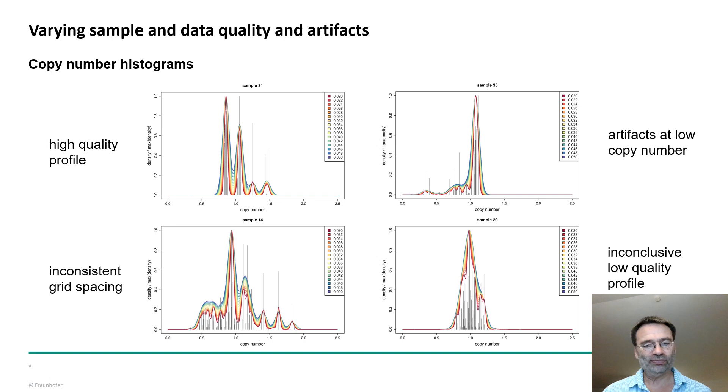So to show you the different quality of the data, the upper left image shows a very regular histogram of the copy numbers, and surely you could process those completely automatically with no problems. But often the data are different. Like on the lower left you see some inconsistent grid spacing. You have a rather clear grid spacing on the right side of the main peak, but not so on the left side. Or you have, like in the upper right, a long leftward tail to lower copy numbers. And the lower right shows a profile which is rather inconclusive because you don't see any clear grid spacing at all.